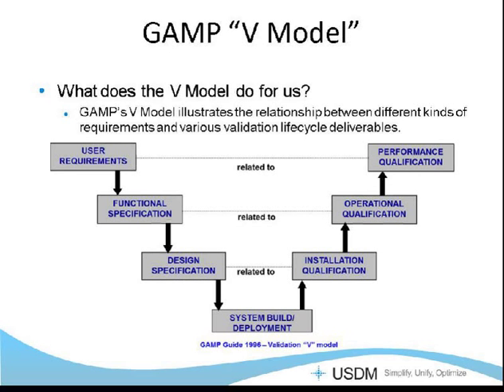GAMP 5 is really a standard process. It is not the only process for computer system validation, but it is a known process. It's a common sense process. And one reason that I recommend GAMP 5 is that not only do we all like it, it's fairly simple to follow. There's a lot of people following it out there, so there's precedent, there's knowledge.